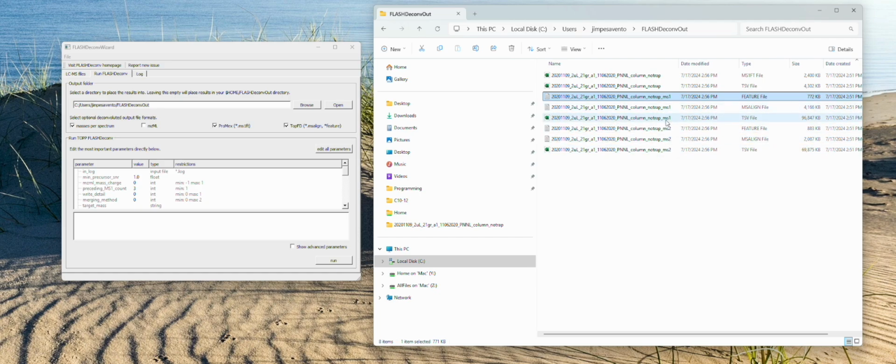on MS level. So the MS1 files are all, of course, the MS1 information, so all the precursor masses and everything that is seen at that level, and then all the fragmentation data is at MS2 or greater. So, and then this is all the information that has all those fragment ions corresponding back to the precursors.